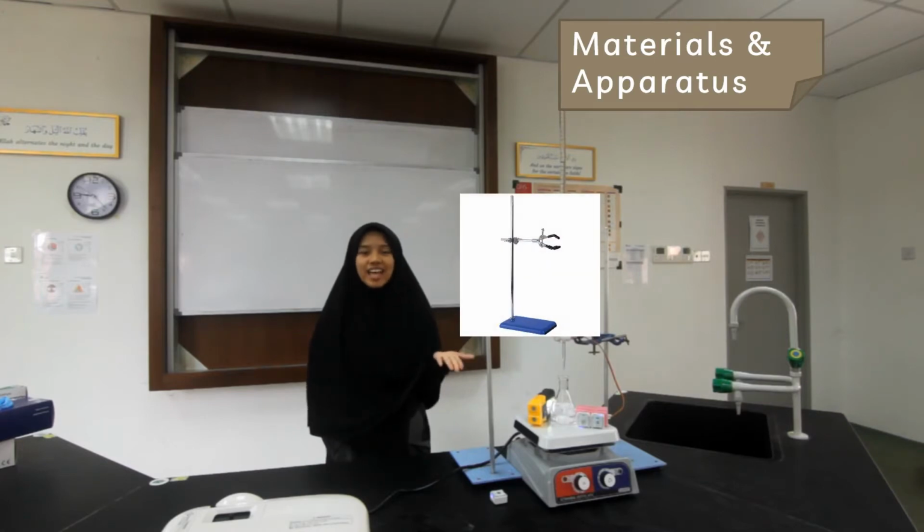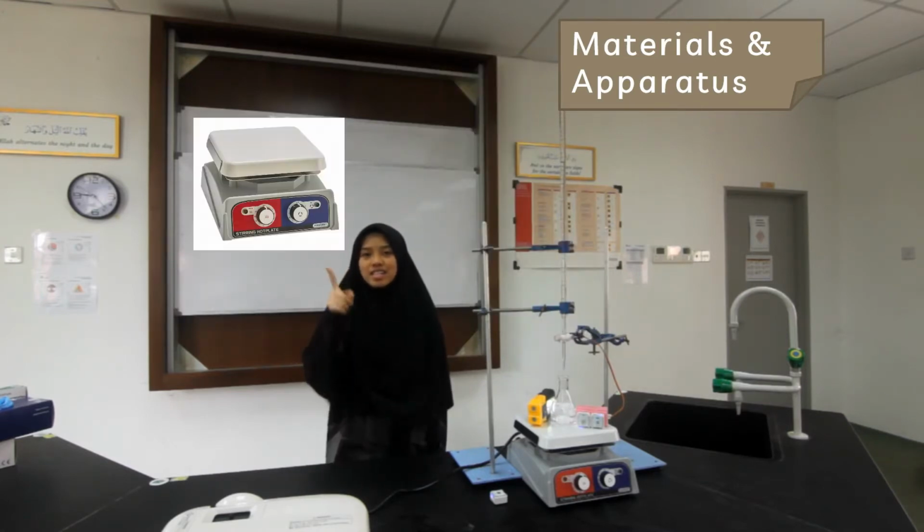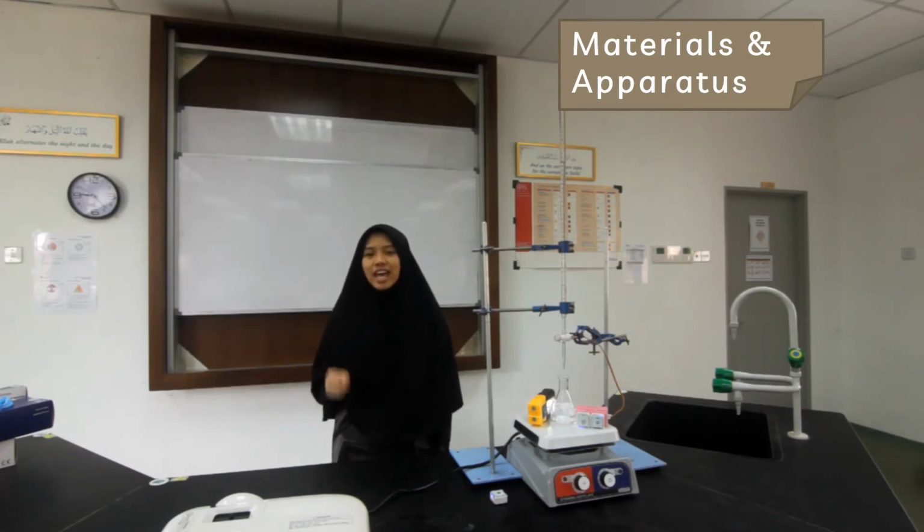In this project, we use a retort stand, light source, burette, stirring hot plate, sodium hydroxide solution, hydrochloric acid solution, and phenolphthalein. This could help students in their experiments and research both at schools and higher learning institutions.